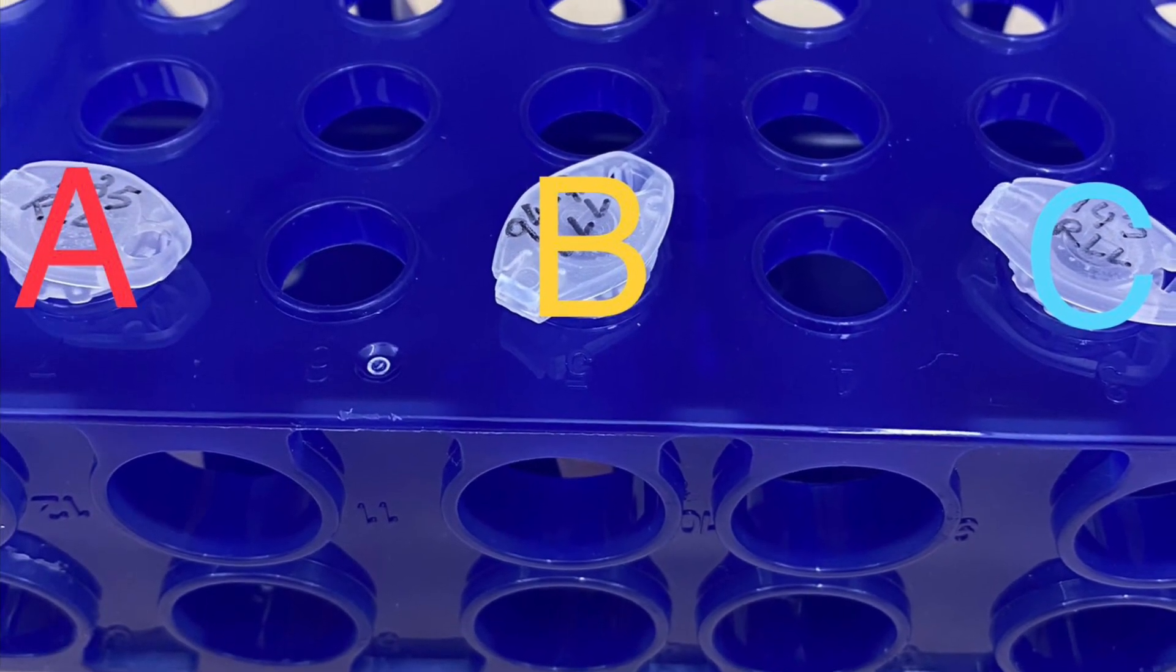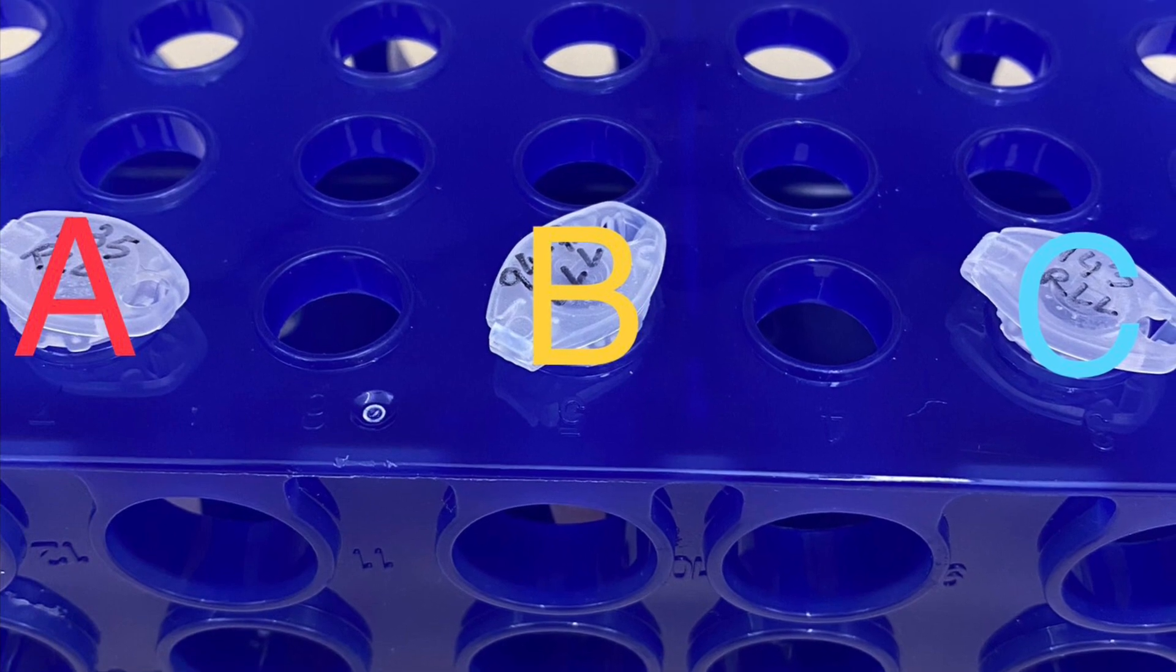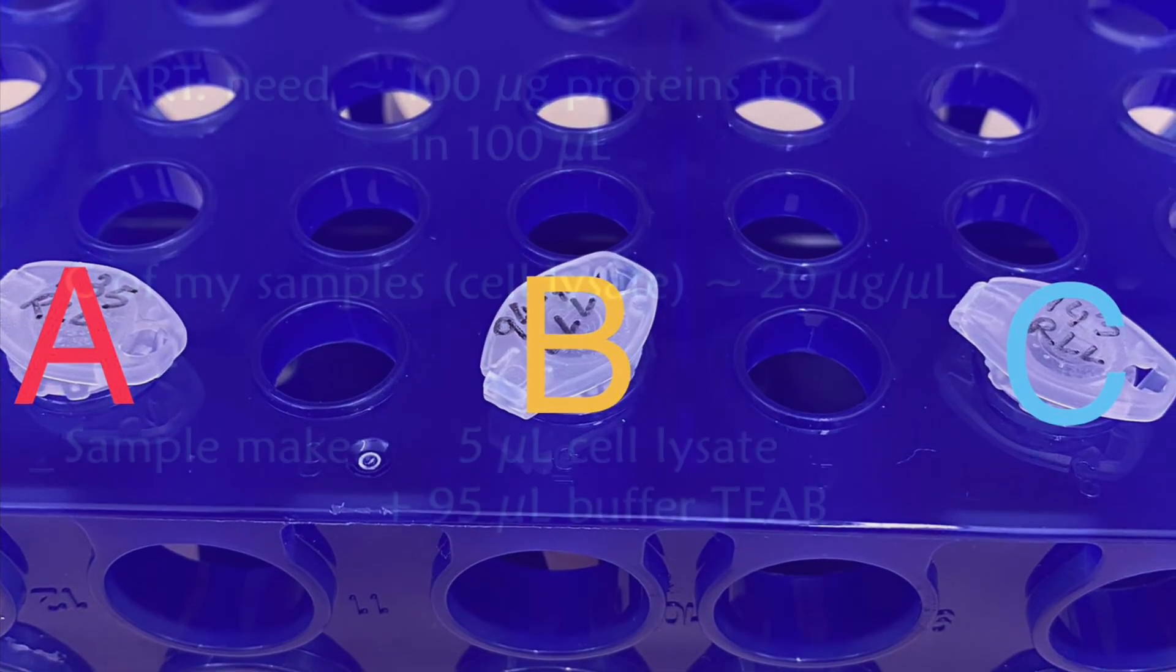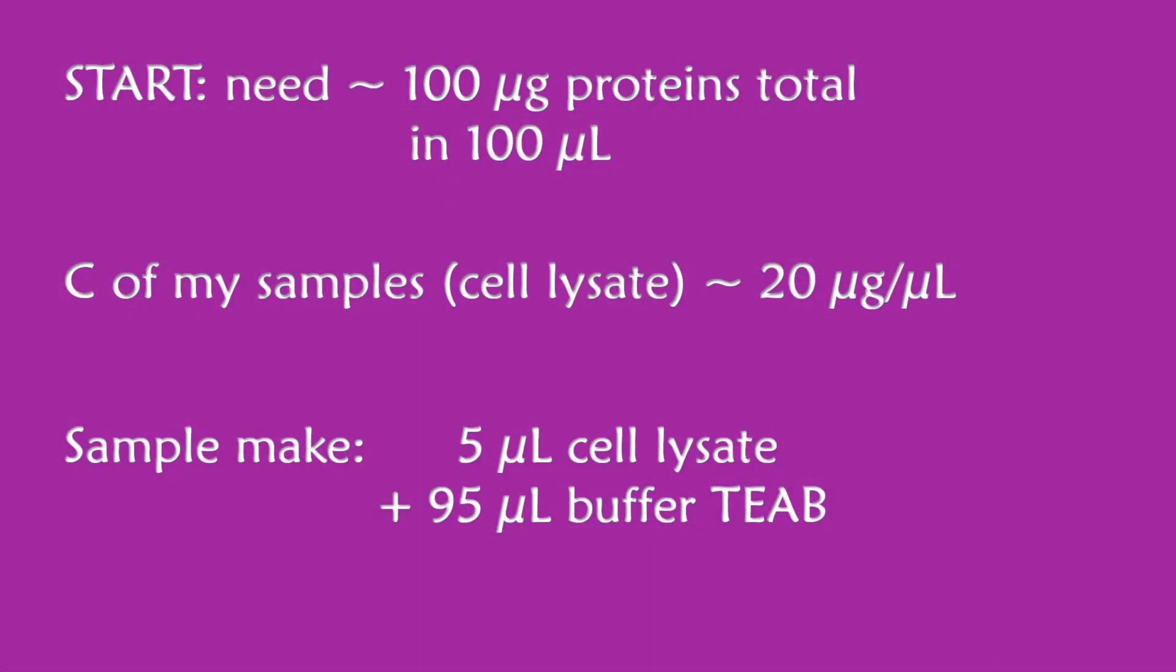I have three samples for today. I just label them as A, B, C. I like to start with 100 micrograms of total proteins. That way I know I'm going to have enough for later. Don't be too brave to go lower than 30, but anything between 30 and 100 should be fine.